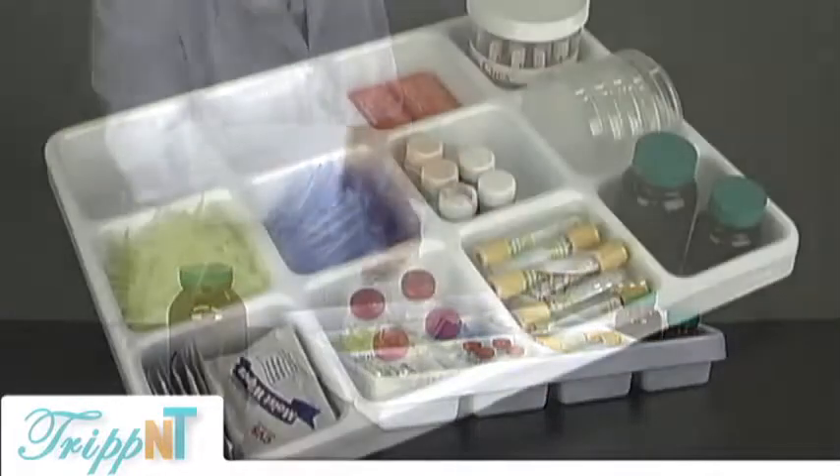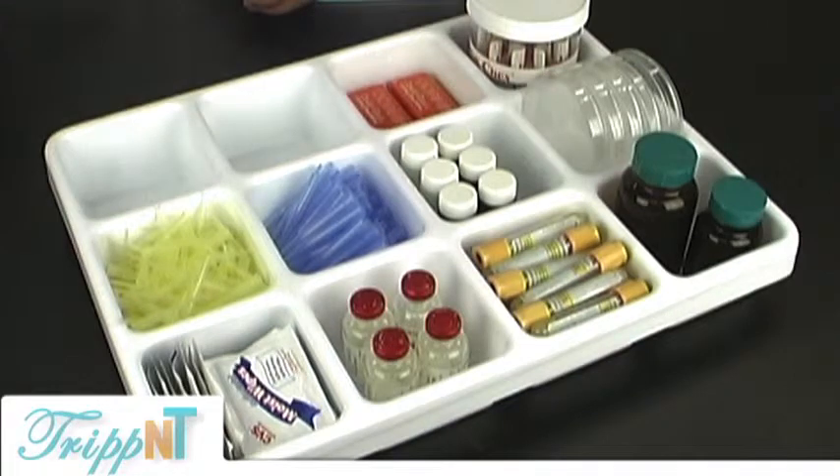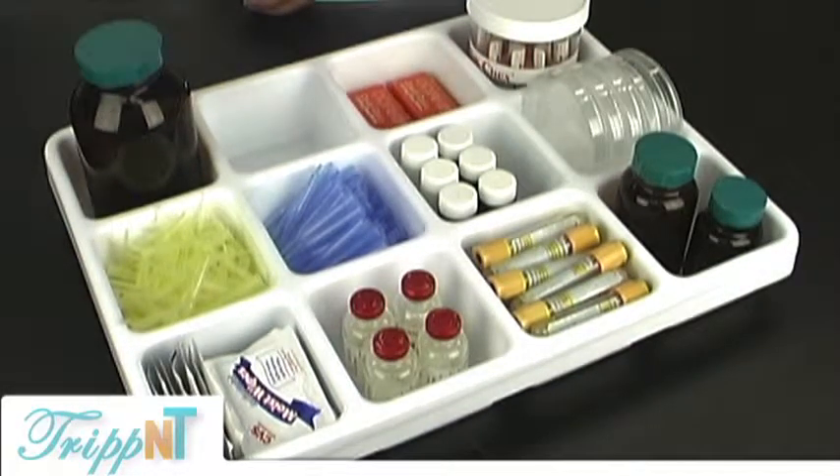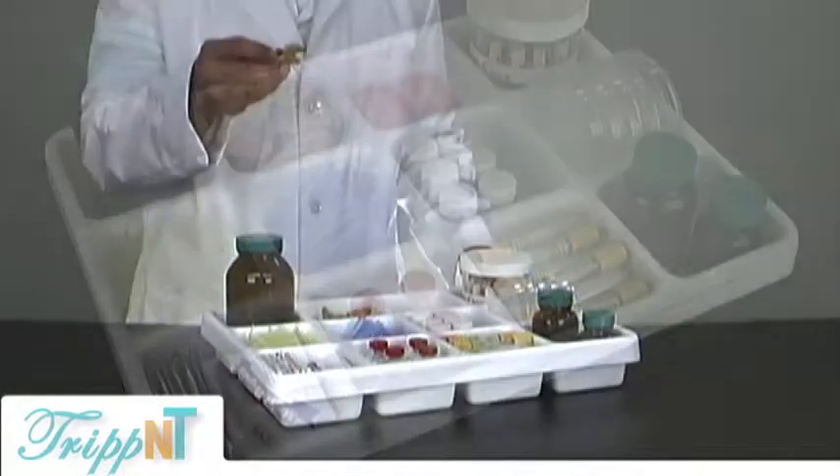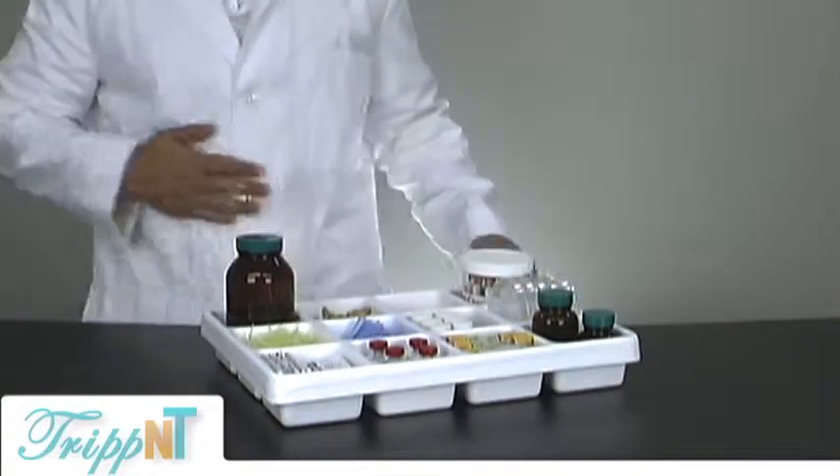You can see here that Neil is just adding a variety of products to the 12-compartment tray — there's a lot of flexibility you can see in the stopper tray.